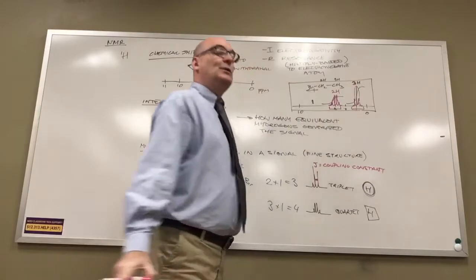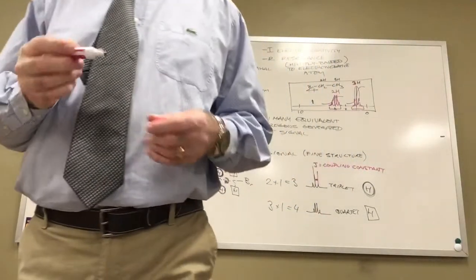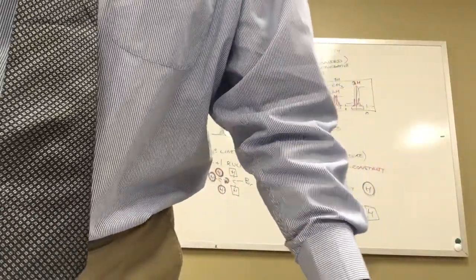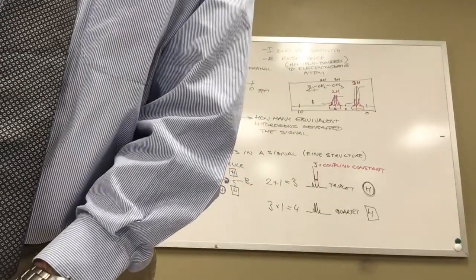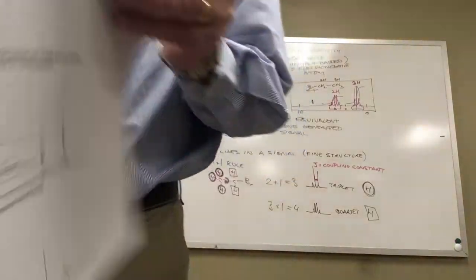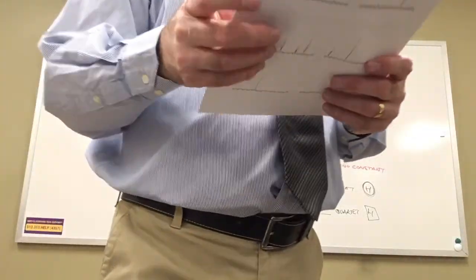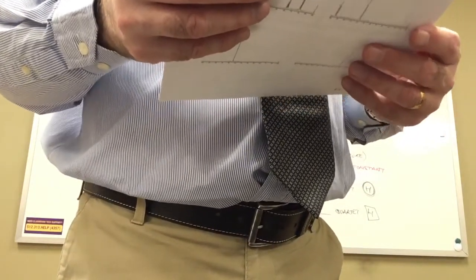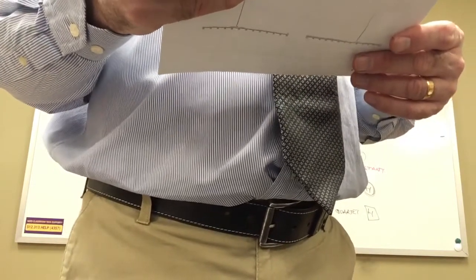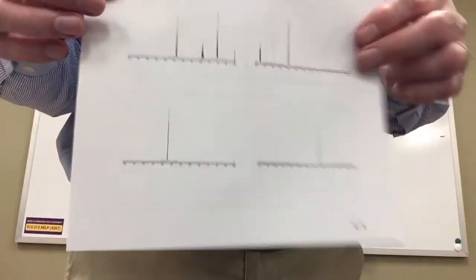And if that value is big or if that value is small, it can reveal information about the stereochemistry or geometry of the molecule that you're looking at. Okay, so question 1 is straightforward. Draw the structures. Question 2 is not particularly difficult. Question 3 is straightforward.